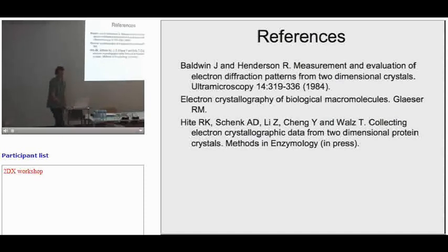We don't need to use phase extension because there is an atomic resolution structure of another aquaporin that we initially used, and then I've just used Tamir's structure of the original aquaporin 0. But for phase extension, you tend not to want to use something like aquaporin 0, which has an extremely high symmetry and has only one unit in the asymmetric unit cell. You'd want something that has non-crystallographic symmetry so that you could take more advantage of density modification.